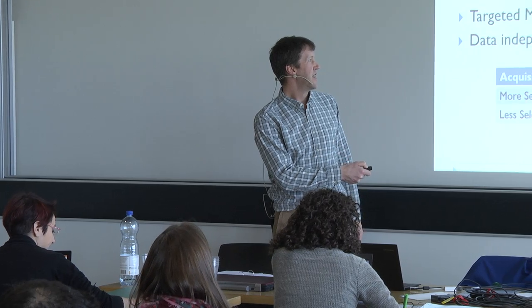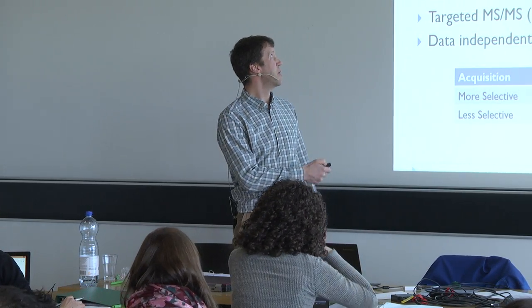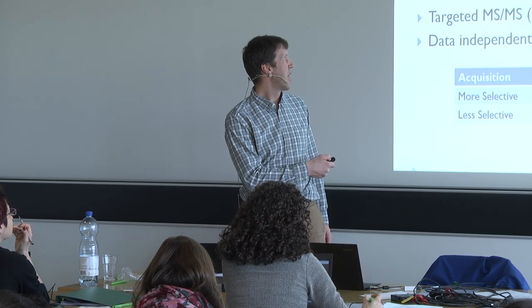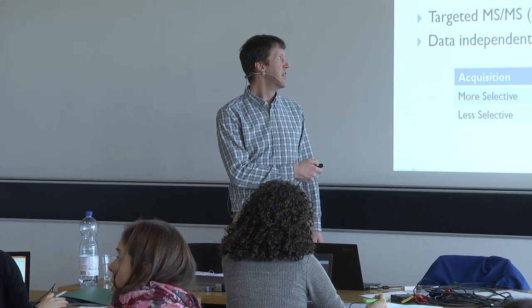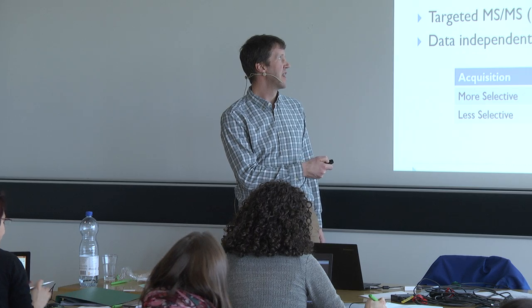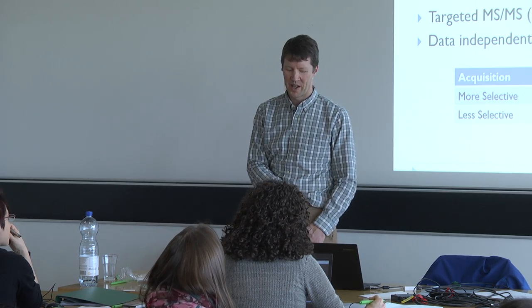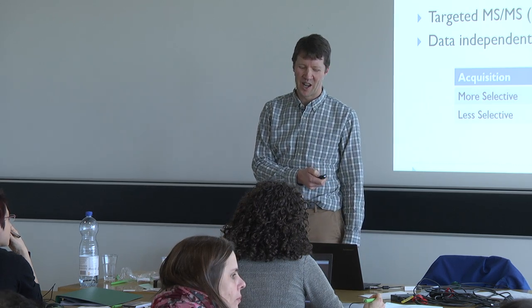This is the set of methods that we've said that Skyline can support: all chromatography-based quantification, SRM, we did PRM, and we've been discussing DIA, data independent swath, with Skyline, and then finally MS1 chromatogram extraction from DDA data, which is what we're going to talk about now. So our one opportunity to talk about that just a little bit.